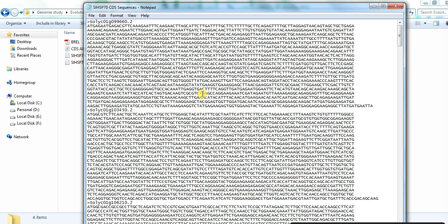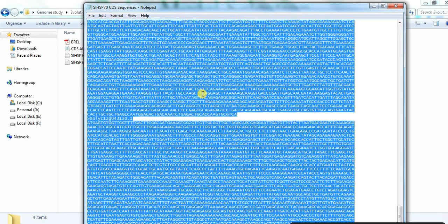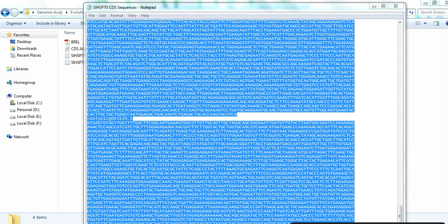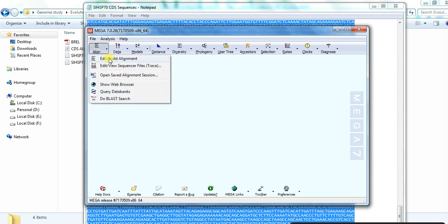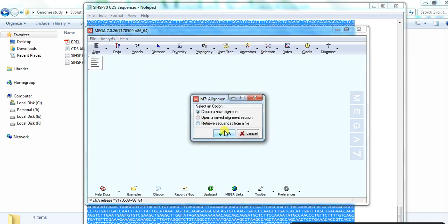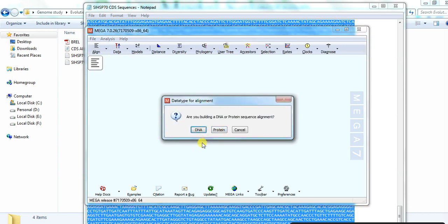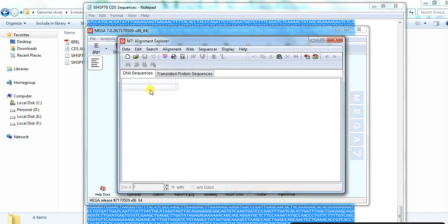Press Ctrl+A to select all, then Ctrl+C to copy. Open MEGA-align and create a new alignment. Since we have DNA sequences, click on DNA, then press Ctrl+V to paste.